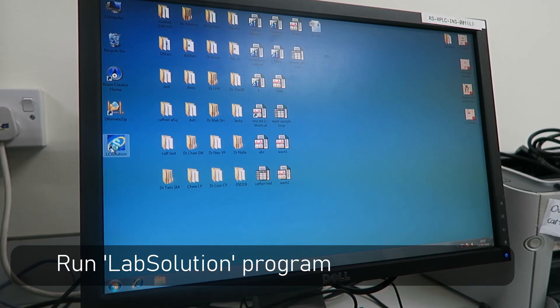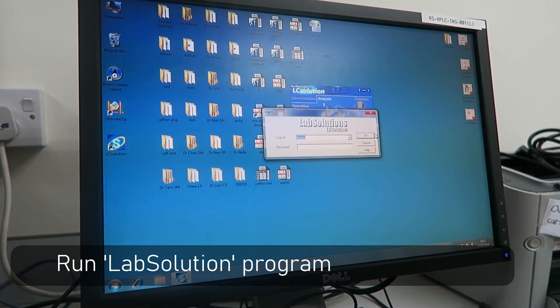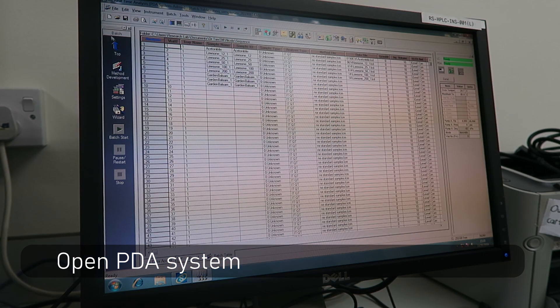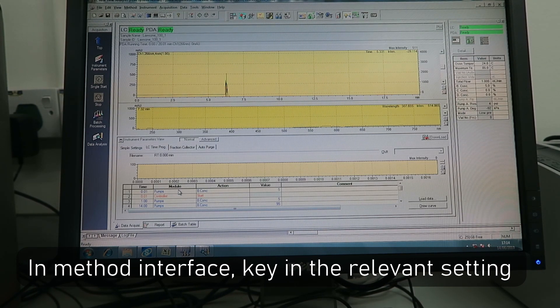Run the LabSolution program. Open the PDA system. And in the method interface, key in the relevant sheet settings.